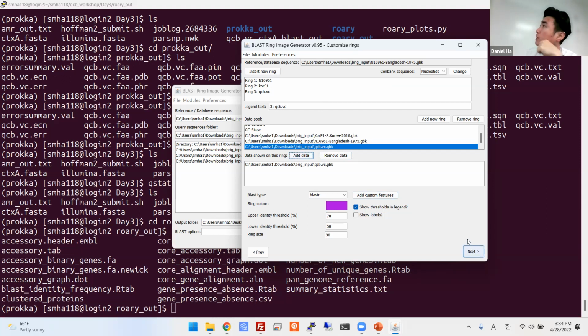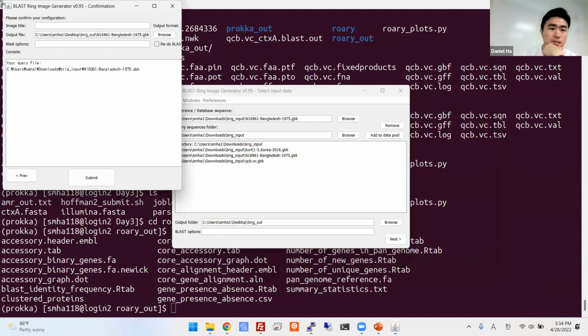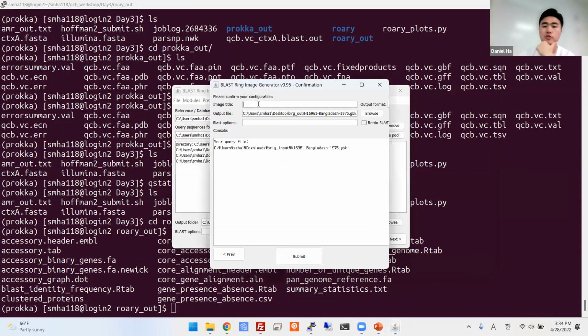Once you have done all that, you can click on next. And you can also name your image title. I'm just going to name it QCB workshop. Once you're done, you can click on submit. If everything's right, it should say it's running a BLAST.